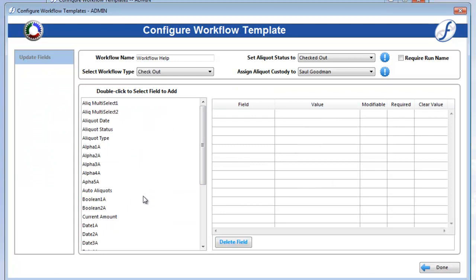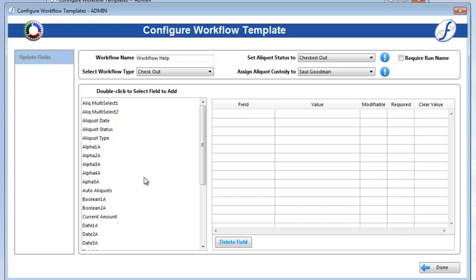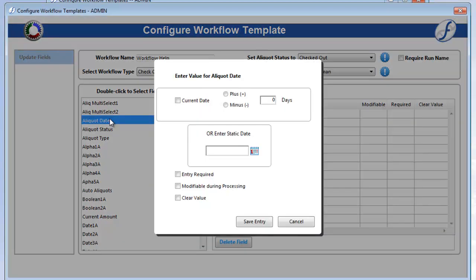In the left box are all the non-unique aliquot fields in your database. To add one to the workflow, simply double-click it. This will open a small entry form.